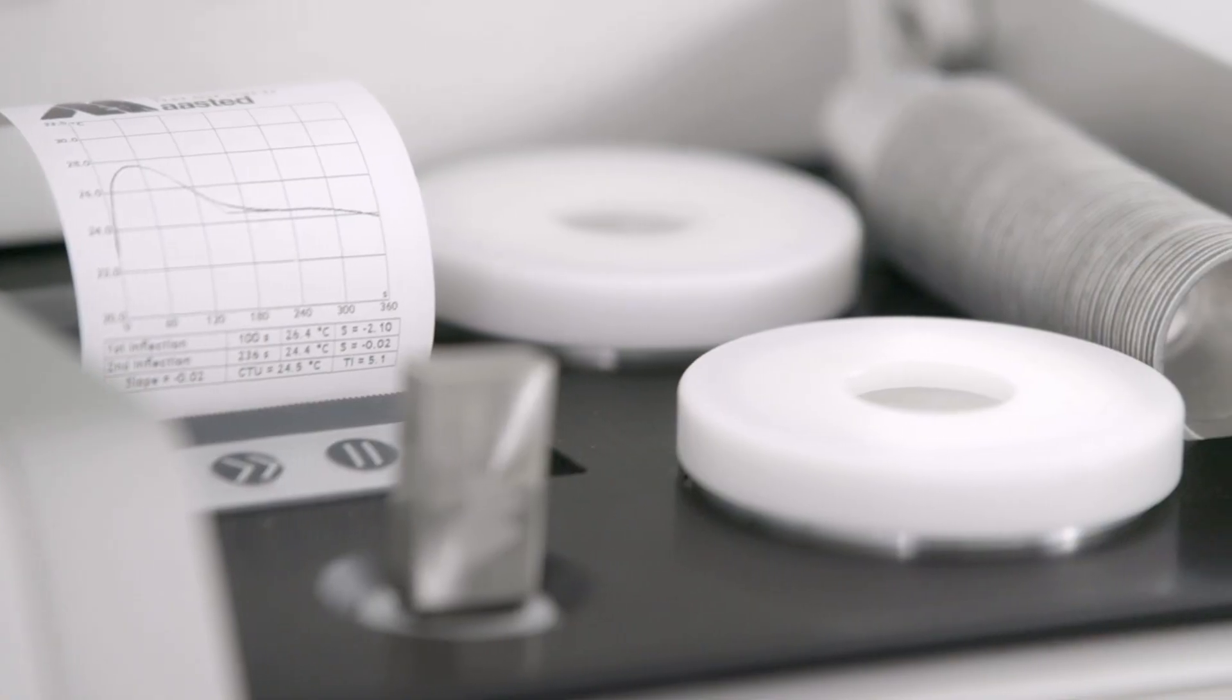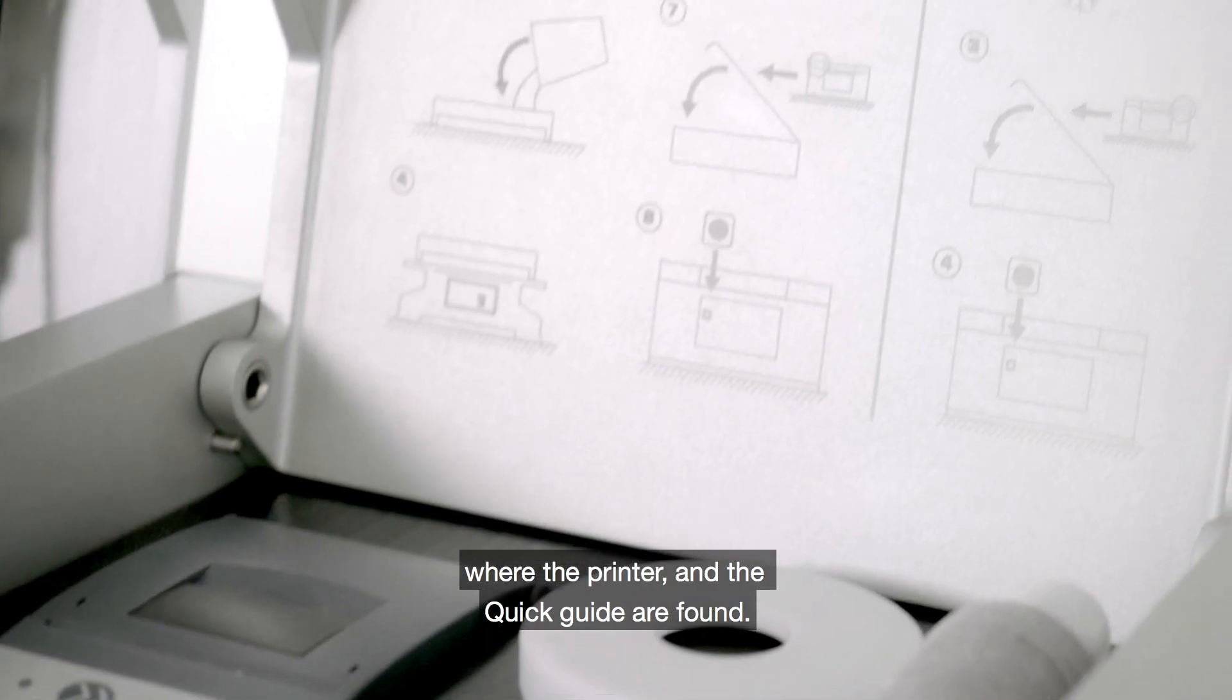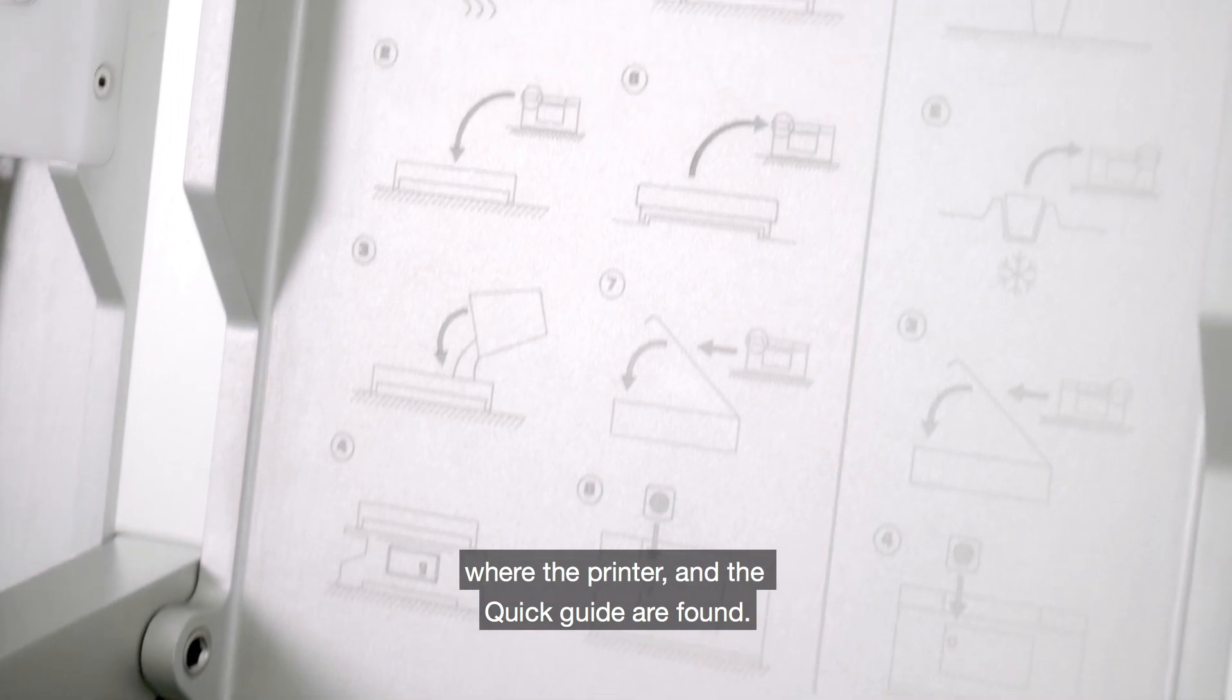Read carefully. Cups and USB can be placed under the middle cover where the printer and the quick guide is found.